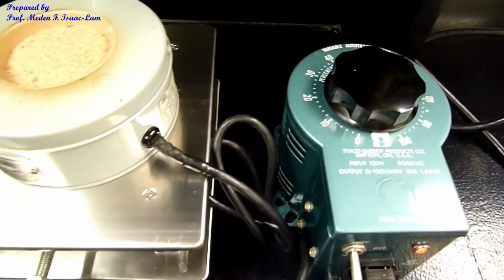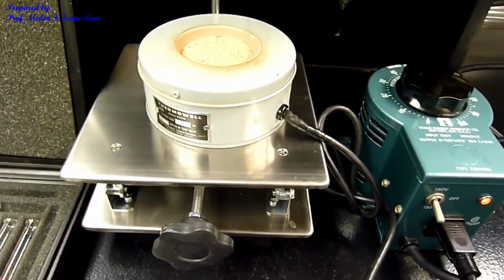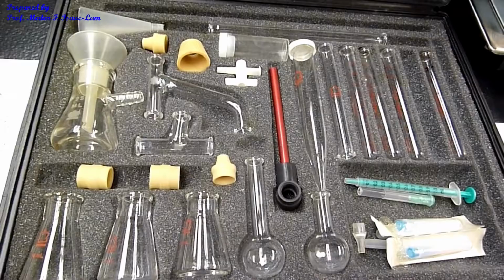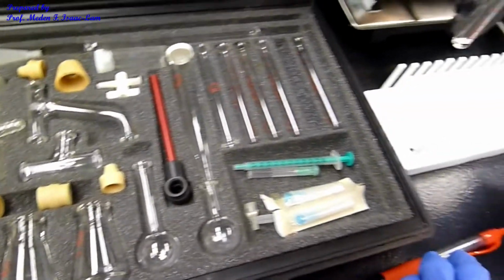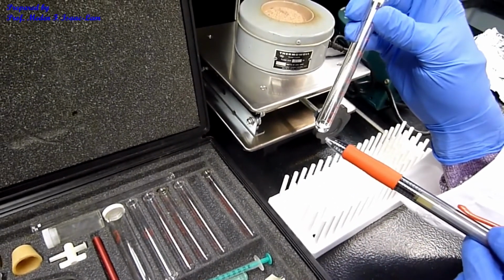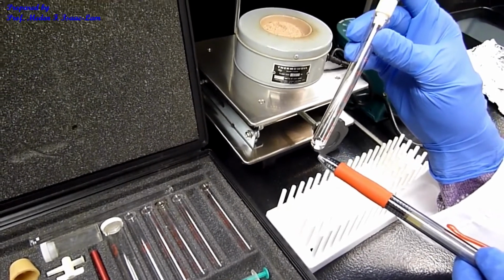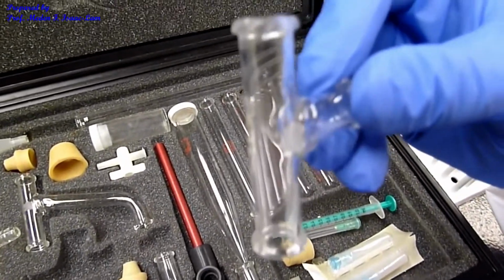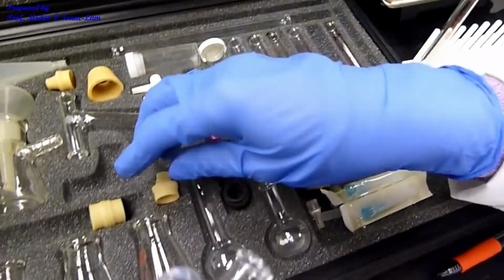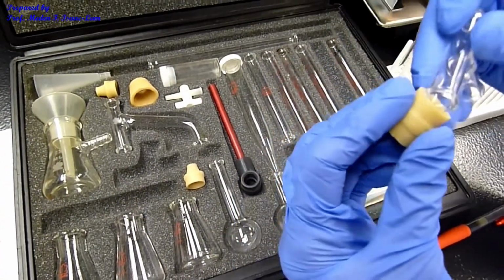If we have not yet reached the boiling point, we are going to increase the setting for the transformer. From the micro kit, I already took out the reaction tube, so I added 8 drops of the liquid, and I also added 1 piece of boiling chip. From the micro kit, I'm going to be using this piece in here, which is a connecting adapter. And then there's also a rubber adapter in here. And then I'm going to just snap it.